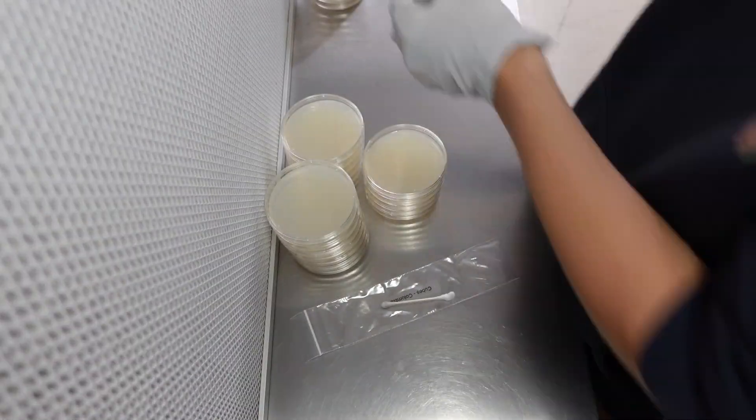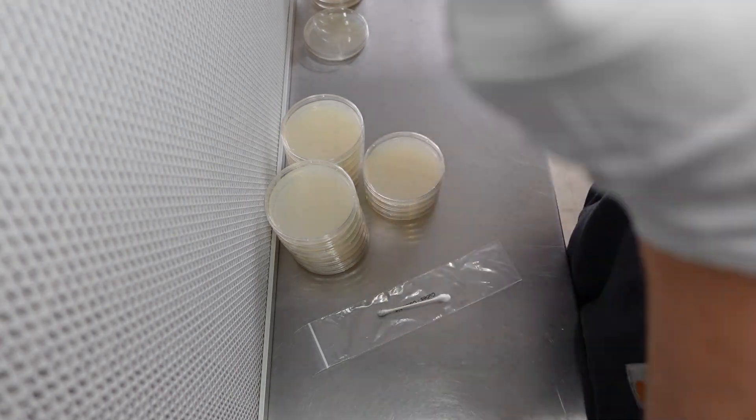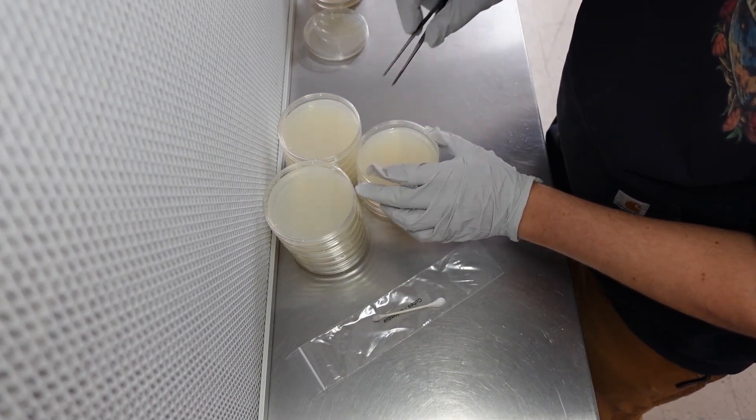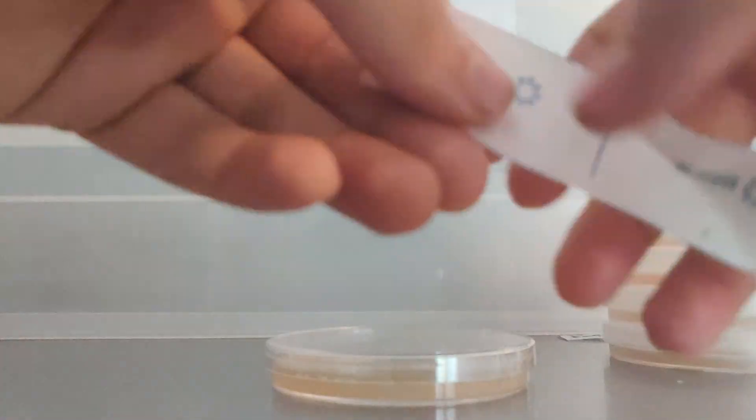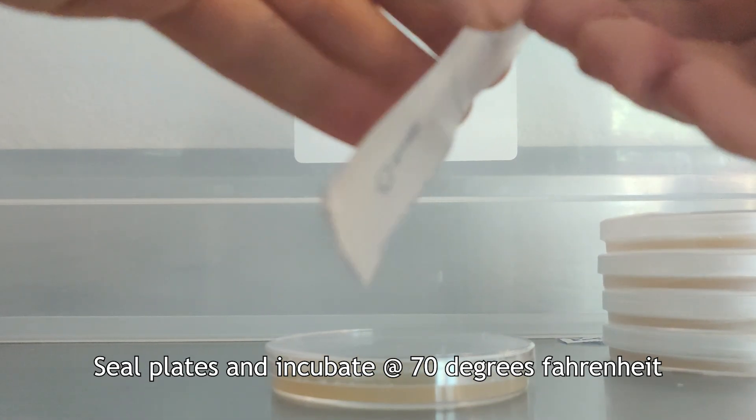If you are using a spore syringe, carefully place one to two drops of solution on each agar plate. After your plates are inoculated, seal them with parafilm or store them in clean plastic bags for incubation.